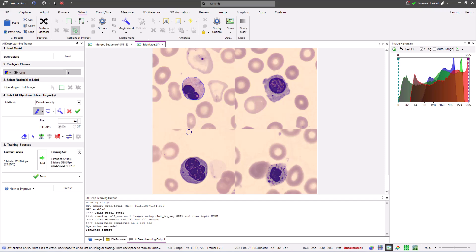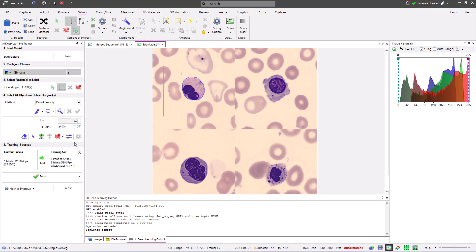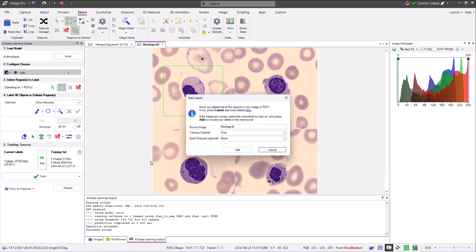However, if I add a region of interest that contains only valid objects, adding this data to the training set becomes a valid option. Now when I click the Add button, only the data within the region of interest, which is correctly labeled, would be used for training.